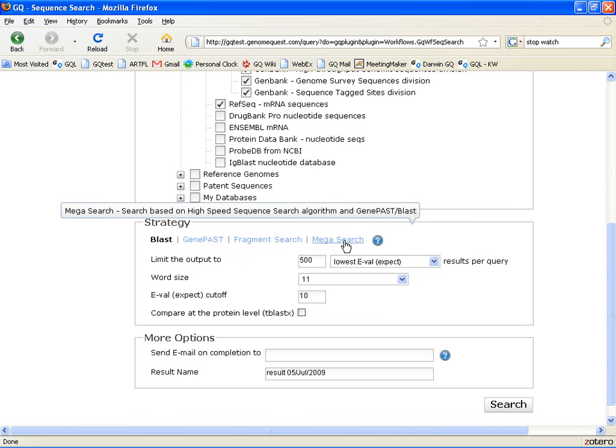More importantly, MegaSearch is the algorithm that is best suited if you have very large numbers of query sequences. For example, in the first step, if we had chosen an entire database, it is very likely that we would have to choose MegaSearch here because it is more efficient.